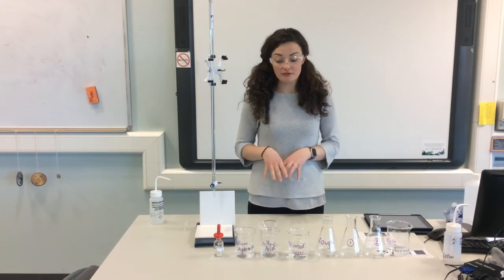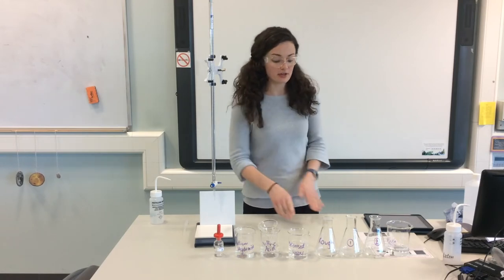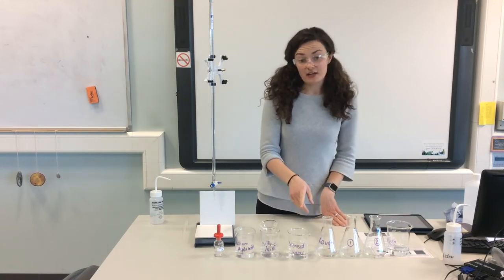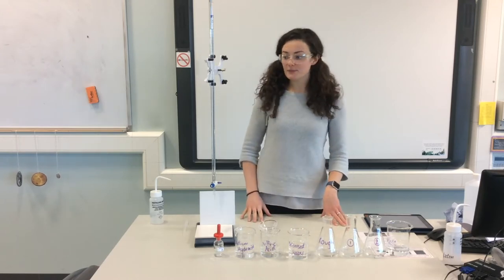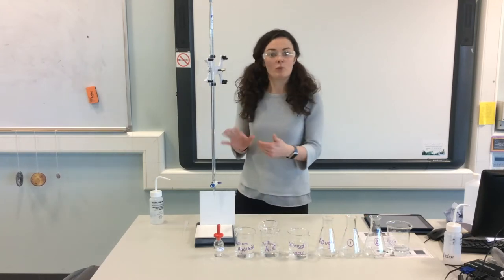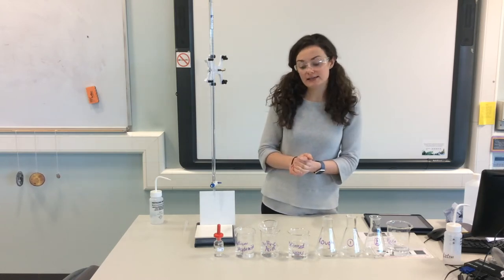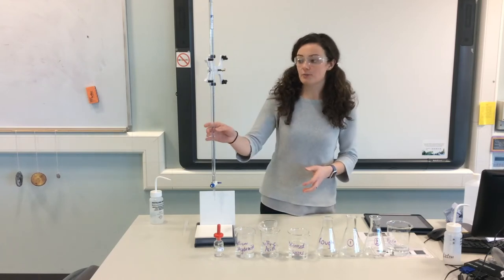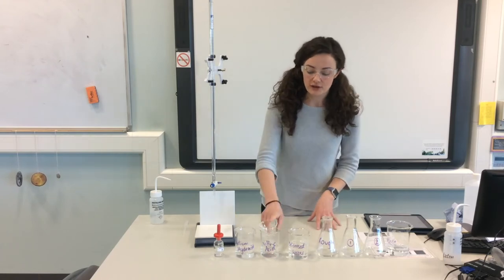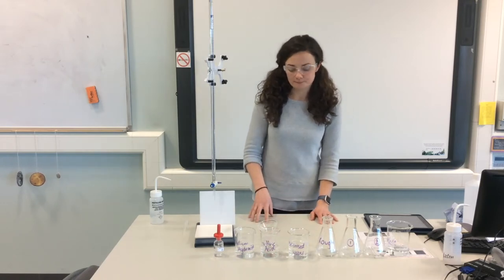So now that we have our titration prepared, in the sense that our burette is filled, and you'll see from the previous video that I filled my three conical flasks using the pipette, let's have a chat about what is in what apparatus. Our burette currently contains our standard solution. We always put our standard solution in the burette, the one we know the concentration of. That's our sulfuric acid, and we know that it's 0.05 molar.